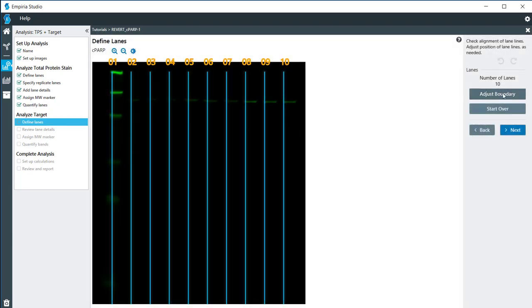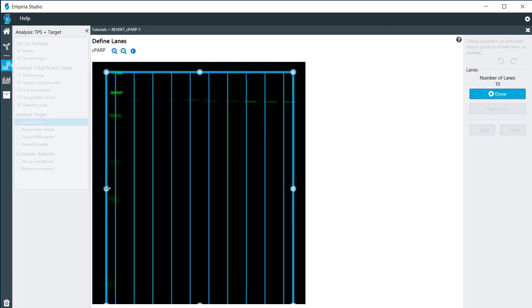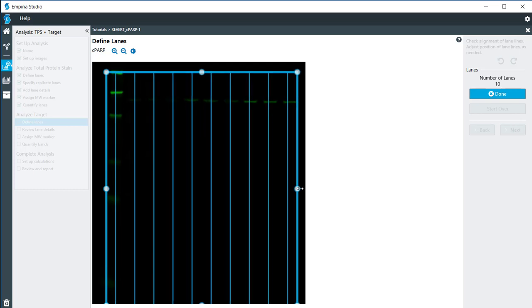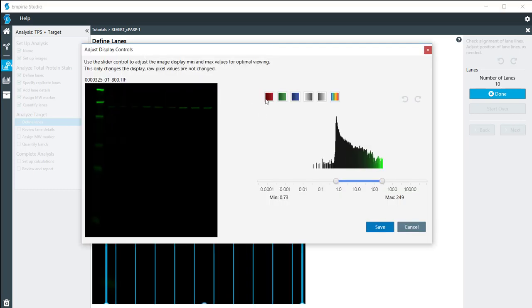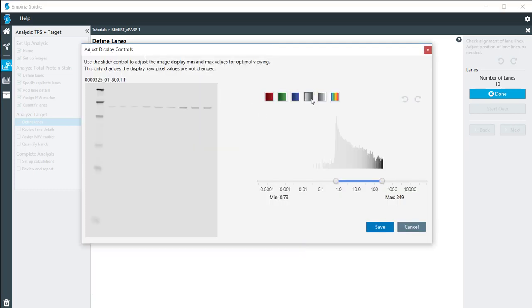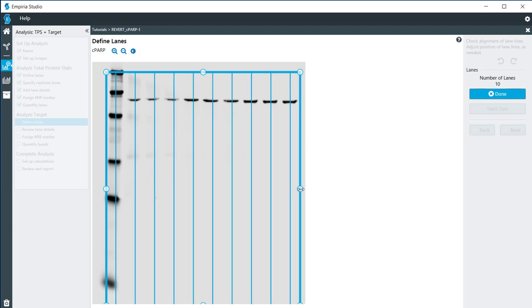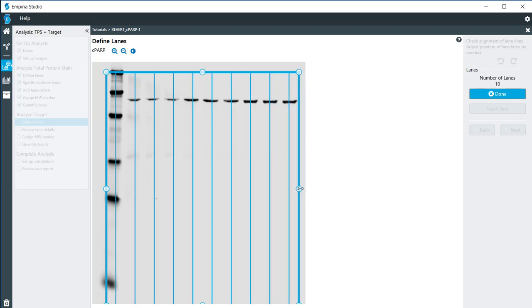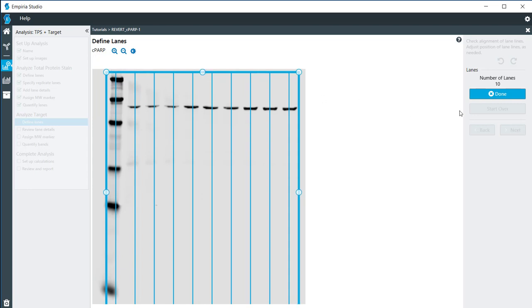For my target, I'm going to adjust the boundary here a little bit. Just so that we can see this a little better, I'm going to adjust the image and adjust the boundary just a little bit more, and then click Done.